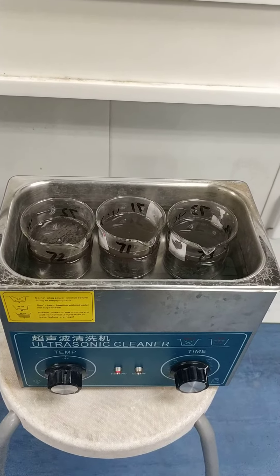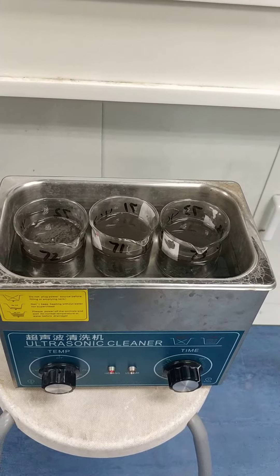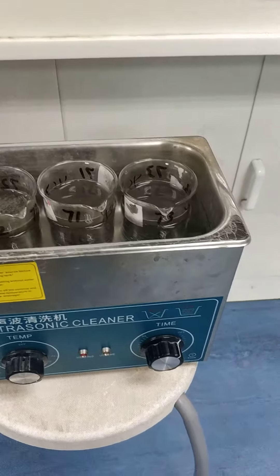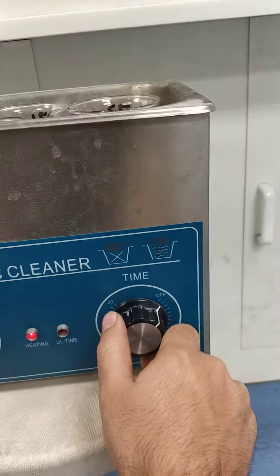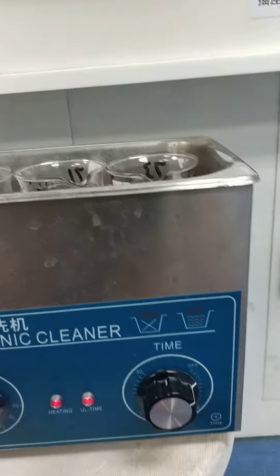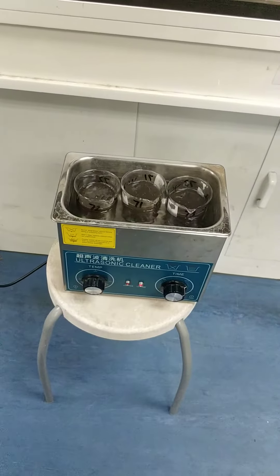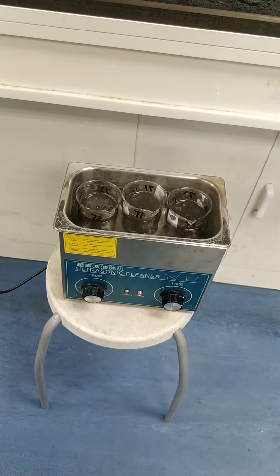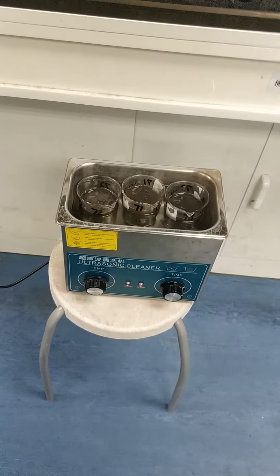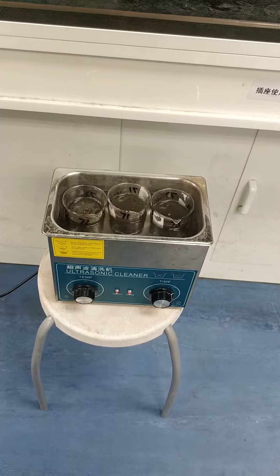After that, the cleaning of the rock sample is finished. This is the final procedure of the ultrasonic cleaner for rock samples. Thank you guys. I hope you enjoyed that video.